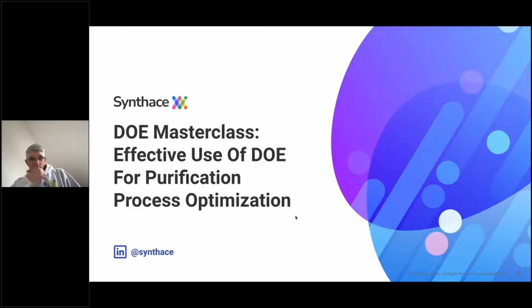Optimization. So the number of runs that are possible to run in a given DOE or optimization campaign is a primary constraint when we're thinking about how to design an optimization strategy. This is particularly true when the final process we're optimizing will be run at large scale, and where actually running that large scale can be prohibitively expensive.